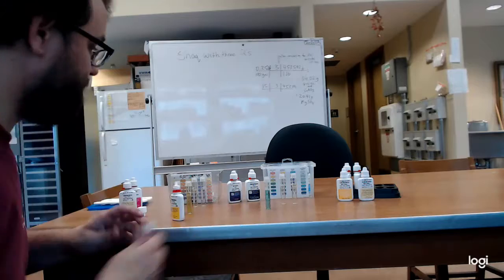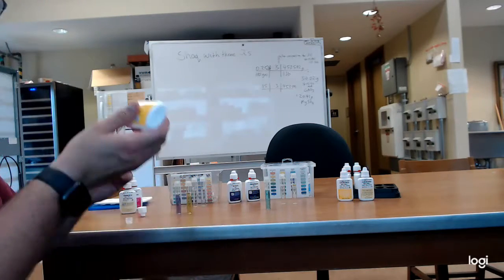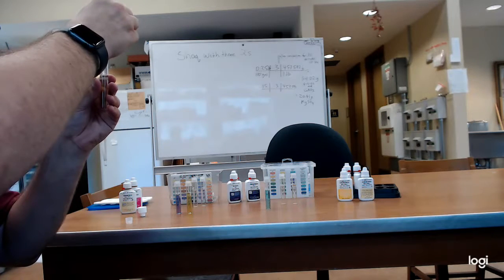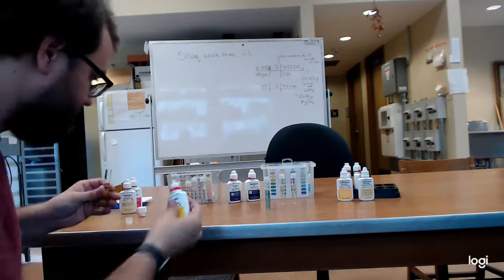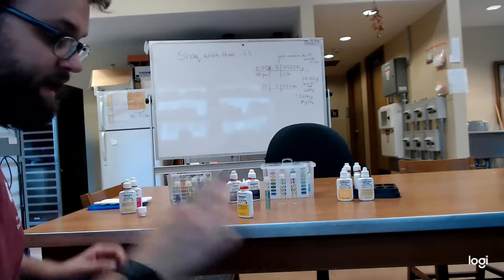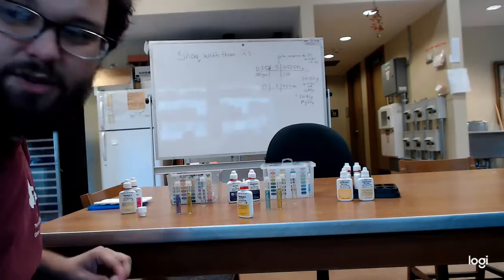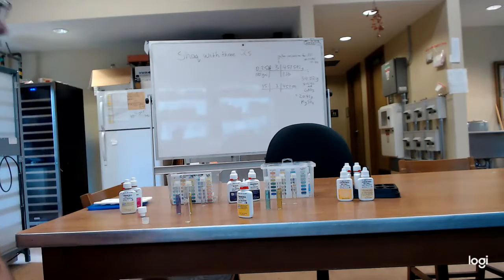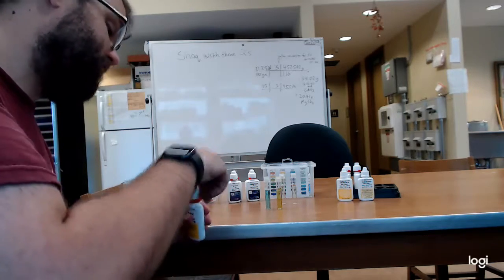And I just wanted to show you these because it's a really good delineator for organic versus inorganic. You really can see through these titrations the dynamic processes that are going on in a compost tea and the ones that are not going on in a nutrient solution. Even if it may be kind of an organic nutrient solution, you will get it. Just usually not to the same degree that you would with a compost.